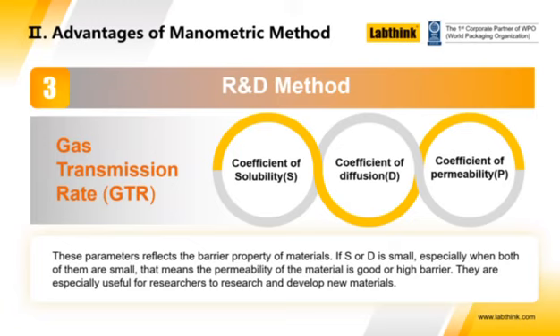So the material used to verify the accuracy and efficacy of the coulometric method was actually created and measured using the manometric method. The conclusion of the authors of the standard is that there is a high degree of correlation between the two methods.